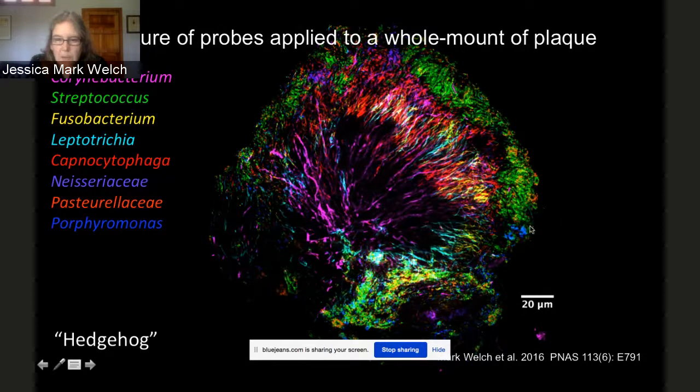And one interesting thing here is that amongst these taxa in this outer aerobic shell is Porphyromonas. The Porphyromonas that everybody studies, Porphyromonas gingivalis, is a strict anaerobe. And yet the presence of this taxon in the outer shell suggests that it is a different Porphyromonas that's an aerobe. Actually, there's 2. In fact, there are these guys in the outer shell, and then there are some little rods in here. And it turns out in the sequencing data, there are 2 really understudied Porphyromonas taxa that are in rather high abundance. We are suggesting that this is some evidence that they may be aero tolerant.